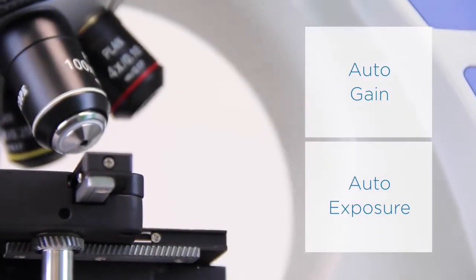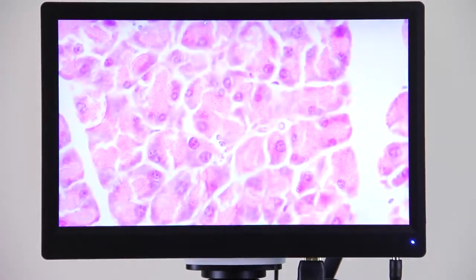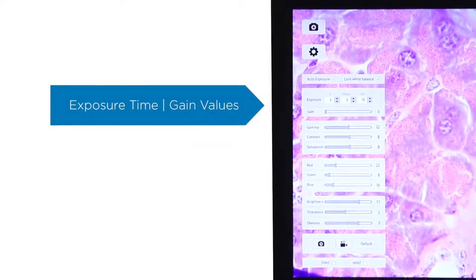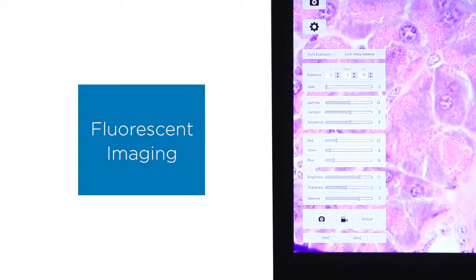With the auto-gain and exposure features, white balance, color correction, and optimal exposure occur automatically every time you change magnification. The exposure time and gain values are highly adjustable too, making it optimal for fluorescent imaging.